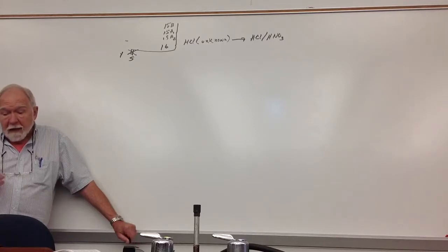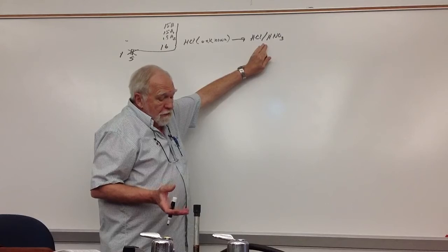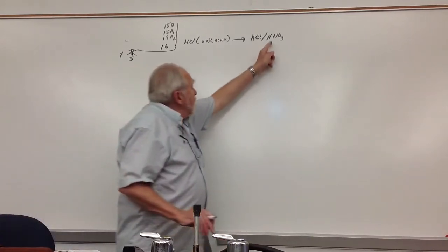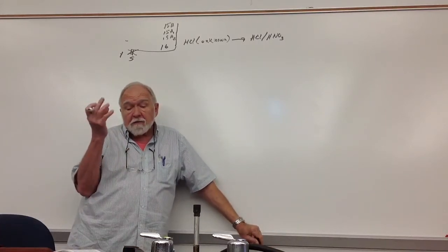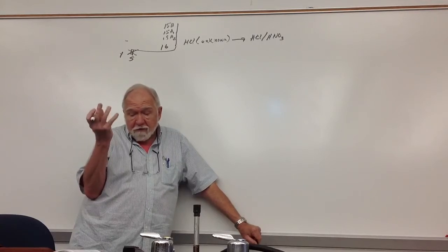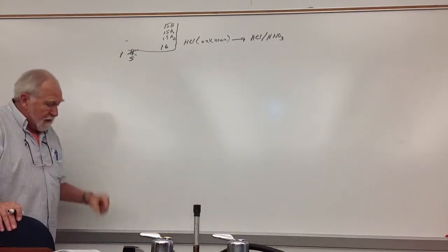But several people had that happen to them in procedure 7. Because it was the same basic thing, in the last part of procedure 7, where you're trying to do the test for the mercury 2 ion, you're trying to dissolve HgS. You're using the aqua regia mixture. The oxidizing agent here converts any sulfides to sulfur. Sometimes sulfur is finely divided, like when you're making your precipitates, and it tends to form a colloidal suspension. But other times, as the heat changes, it clumps together and forms that sticky, lumpy mess with the other precipitates sort of mixed in with it. I wouldn't say dissolved, they're just mixed thoroughly.